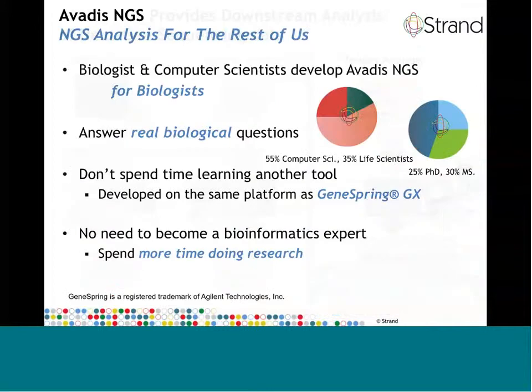We at Strand designed Avadis NGS specifically for you, the biologist, who is interested in answering a real biological question and does not want to become a bioinformatics expert just to do the work. We have a dedicated team of scientists, a large section of which have advanced degrees in the life sciences, to ensure the tools we develop are relevant for your research.